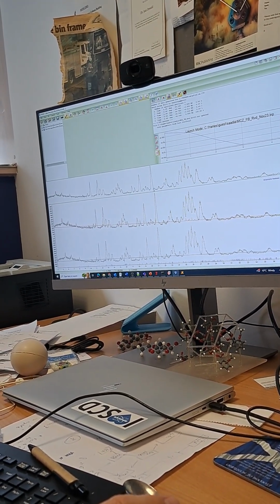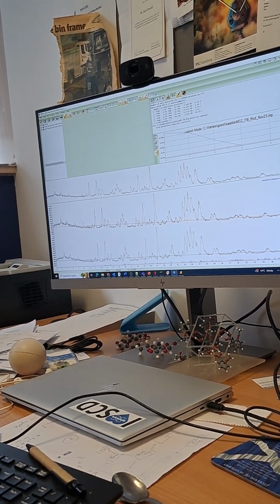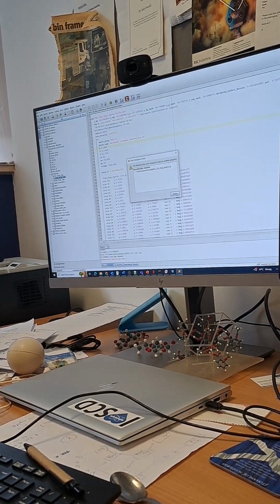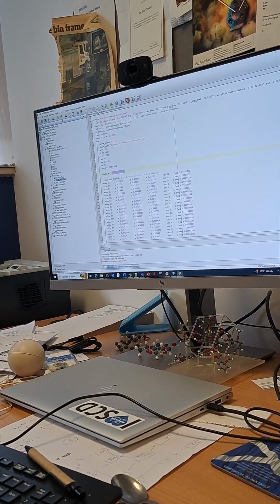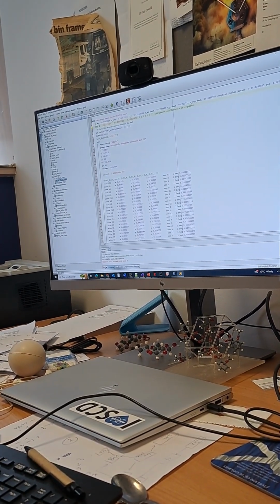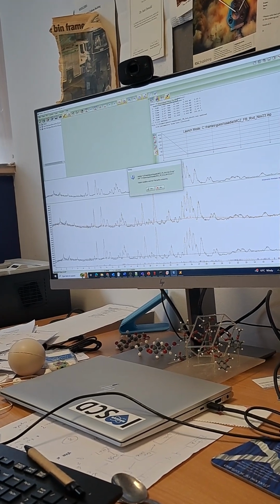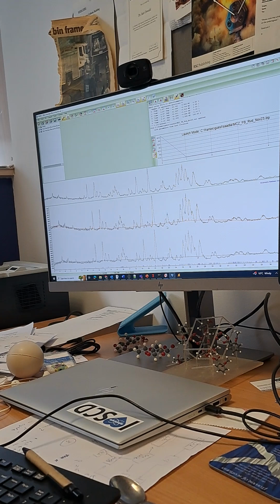Okay, it's not particularly helpful, but you can see the background is pretty woeful as well. We've not really refined anything or done anything. What has been refined is our scale. We've also not put in enough zeros into our background, so we can do that again, making it a little bit better, fractions better.